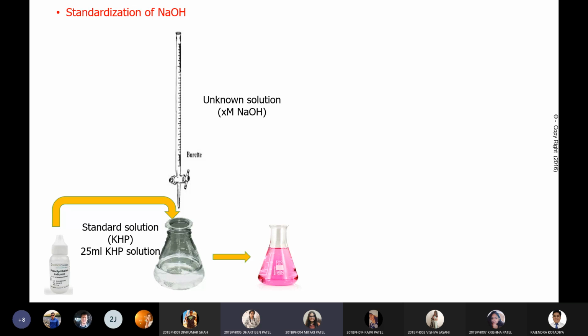Reaction is completed and KHP is used up. Yes, reaction is completed and KHP gets neutralized. Okay, so that is the action of indicator. Now at this point of time we'll get some burette reading. અહીંયા આપણને અમુક બ્યુરેટ રીડિંગ મળશે. ઓકે, સો એ આપણે નોટ ડાઉન કરવાનું છે.